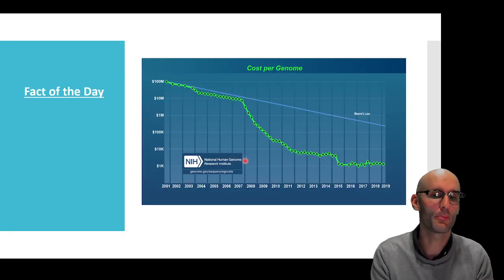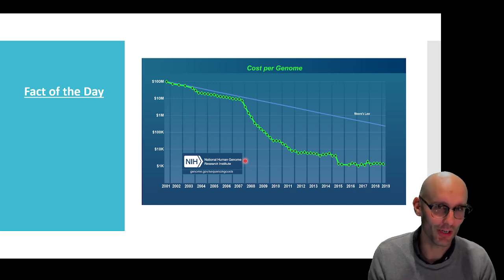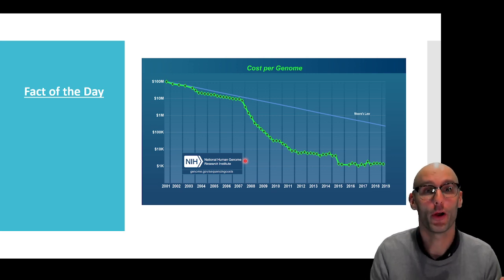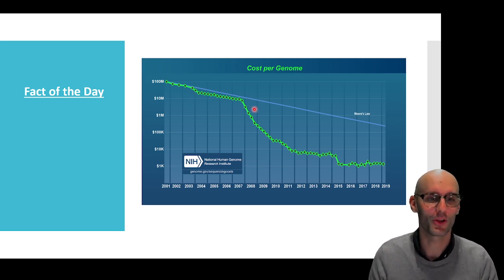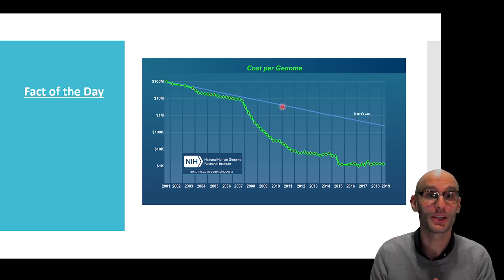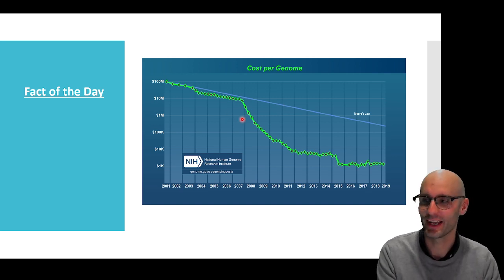First, I just wanted to point out that the first genomes to sequence literally cost billions of dollars, and now we're down to around about $1,000 a genome, which is amazing. You could get your genome sequenced if you wanted. I don't know if you want to know, but sure, you can, and it's actually been a faster development than computers, which followed this thing called Moore's Law, which we can see here. But you can see the price of sequencing genomes has dropped considerably, and a lot of that is because of next generation sequencing, which I'm jumping into right now.